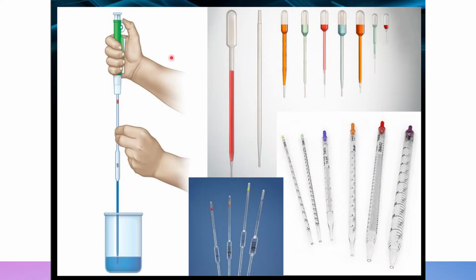With the pipette held in a vertical position and the tip against the side of the receiving vessel, the pipette contents are allowed to drain into the receiving vessel, so to another vessel already.